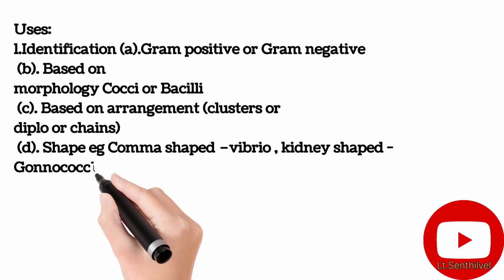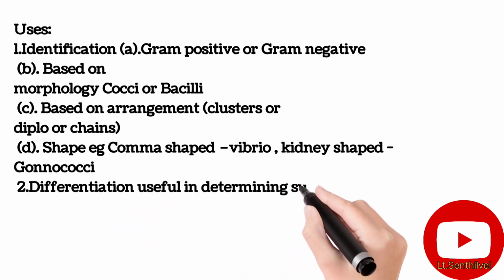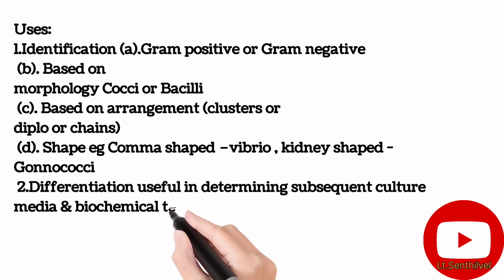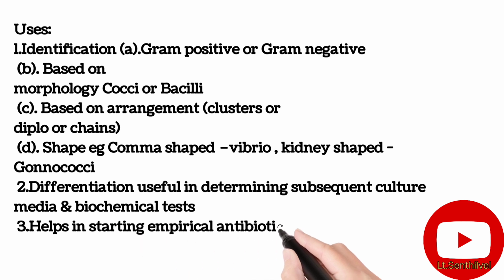2. Differentiation, useful in determining subsequent culture media and biochemical tests. 3. Helps in starting empirical antibiotics in serious infections like meningitis and septicemia.